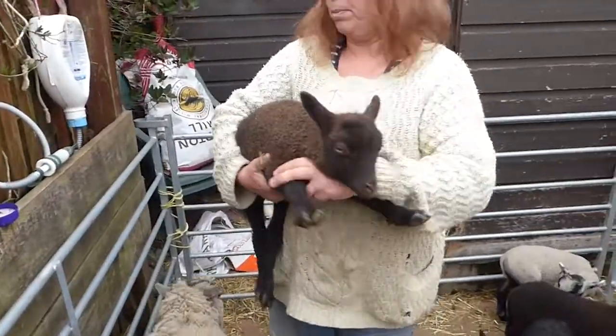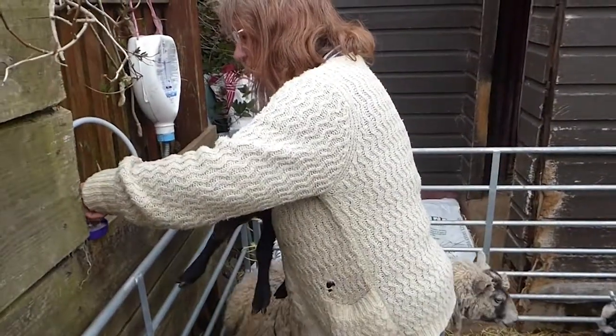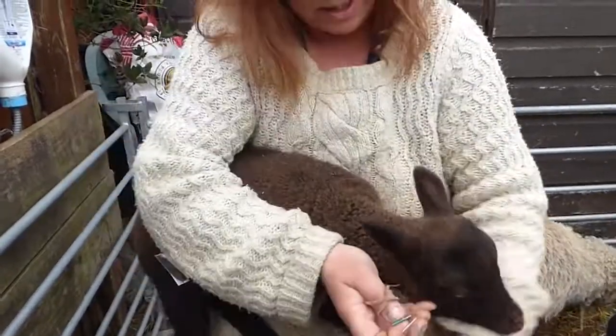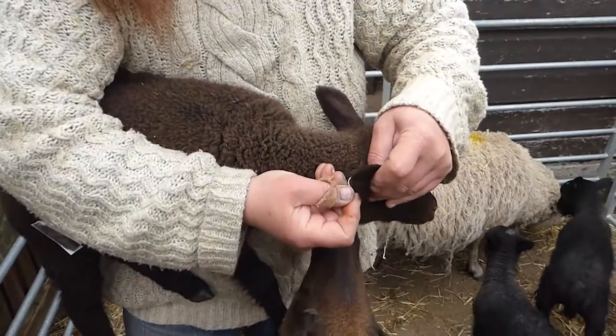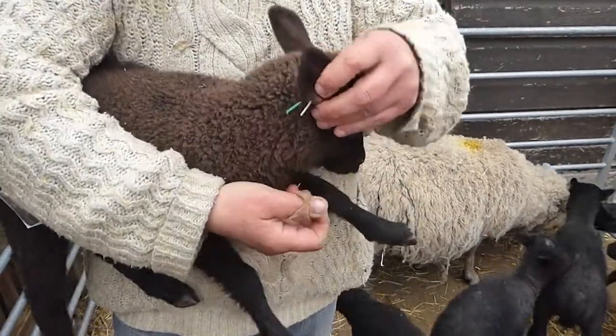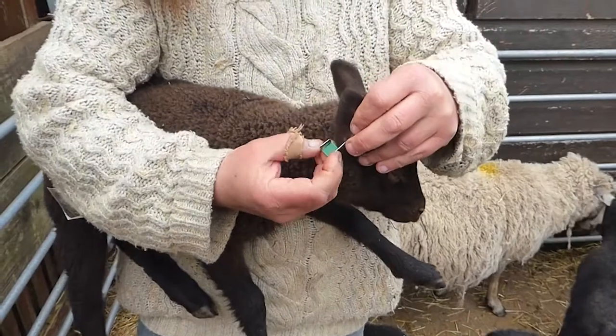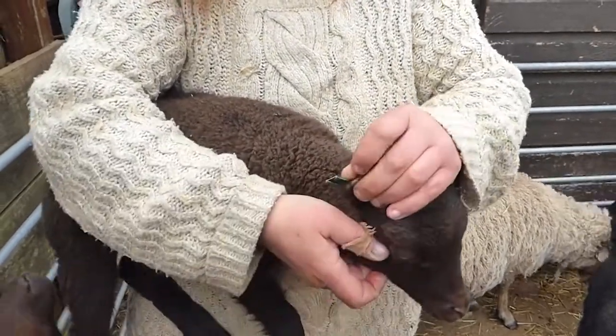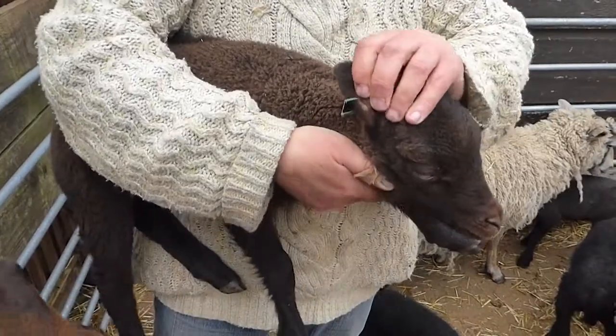Once you've got your lamb in place, take your little ear tag out of the solution, holding the end bit — don't hold the needle end — and straight through the ear just like that, then clip it back onto there and press that, and that's it clipped.